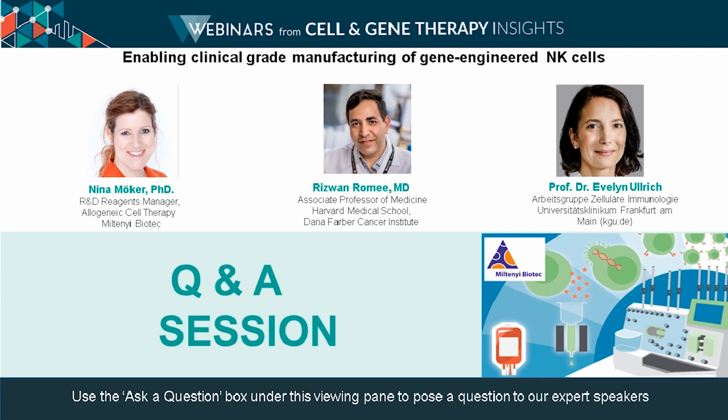In the beginning it was very difficult to overcome the limitations to transduce natural killer cells, because VSVG-pseudotyped lentiviral transduction protocols worked much better in T cells. But in the last years we learned that NK cells express different entry receptors and are quite suitable when the envelope is different. So pseudotyping with RD114, as we found in our group, or the Baboon pseudotyped lentivirus works very well in NK cells.